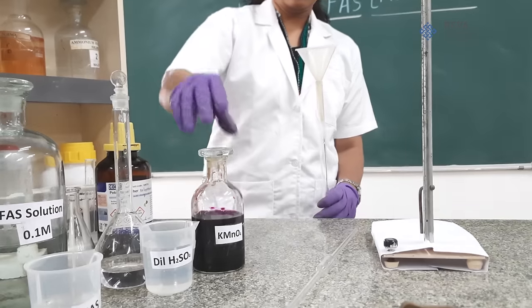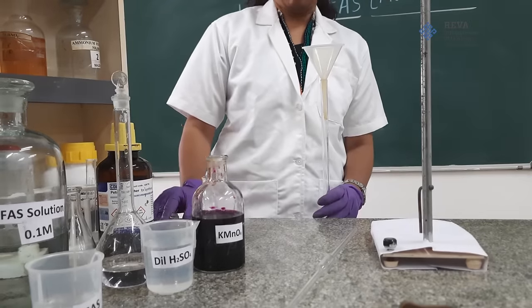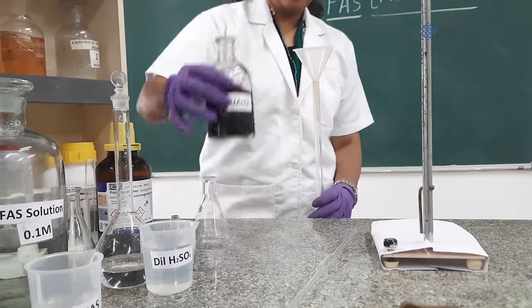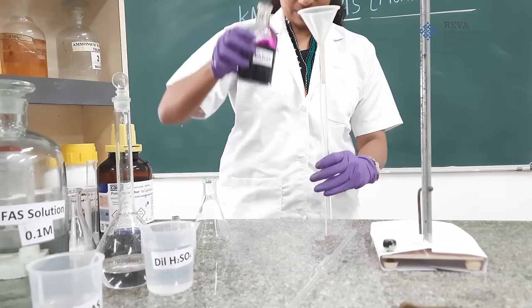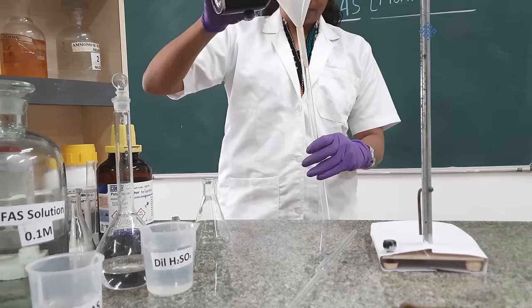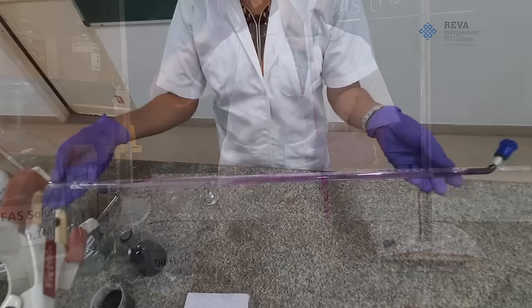The procedure will be as follows. Potassium permanganate solution is a purple colored solution. Now we are going to take this solution, a little of it in a burette, then rinse the burette.